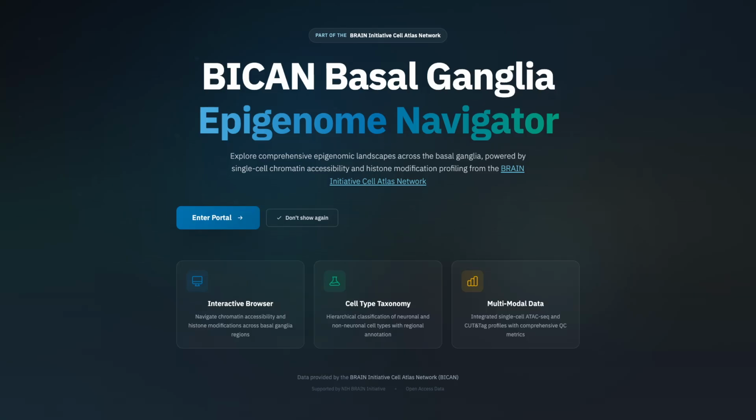Hi everyone, welcome. In this short tutorial, I will introduce the BICAN Basal Ganglia Epigenome Navigator and show you the core workflow for exploring Basal Ganglia epigenomics data. We will focus on three main parts of the portal: taxonomy selection, assay selection, and the genome browser. By the end of this video, you will know how to select cell types, choose assays, and visualize the selected tracks in the genome browser.